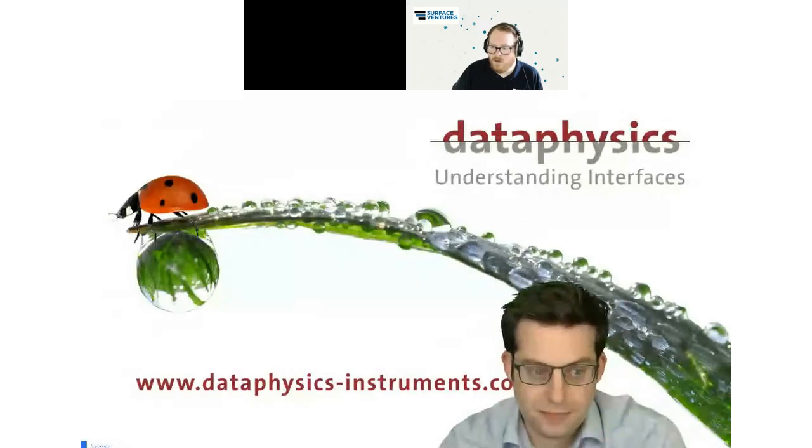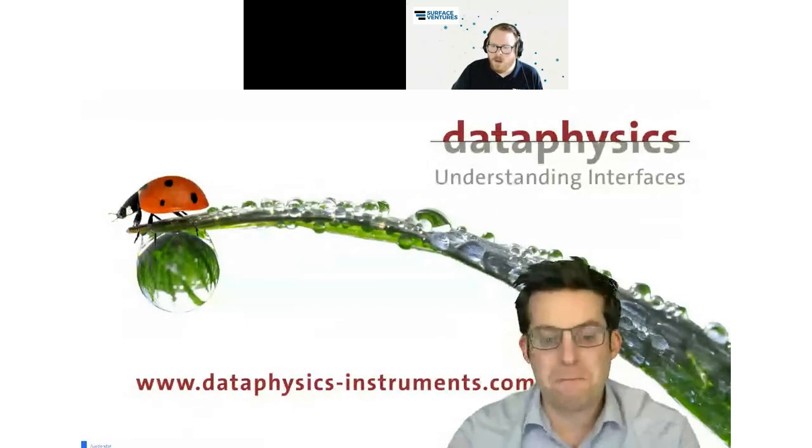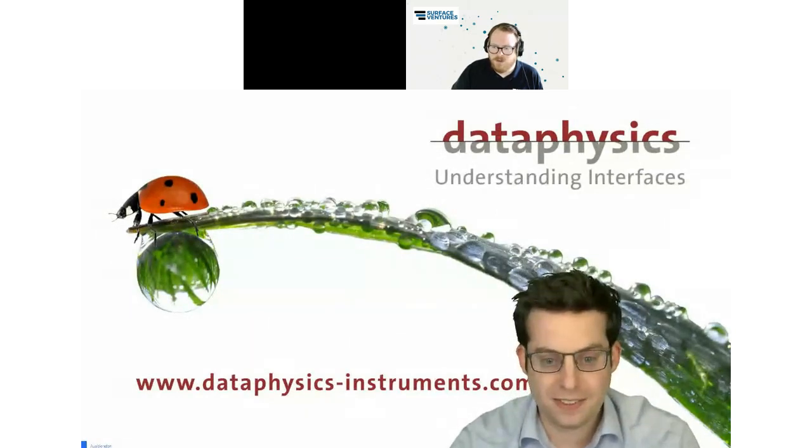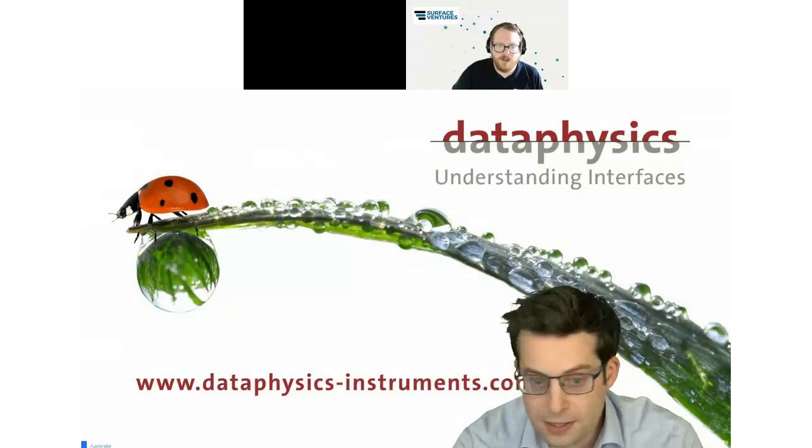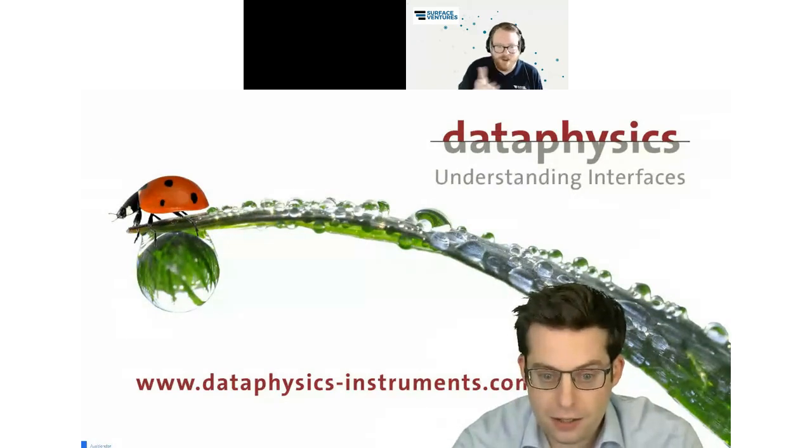Okay, great. We had another question from Amit here. You assume that the solid material is placed normal to the plane of the liquid. However, in the case of flexible materials such as fiber, how would you measure the contact angles via tensiometer? I think that was already demoed pretty much, but sorry.